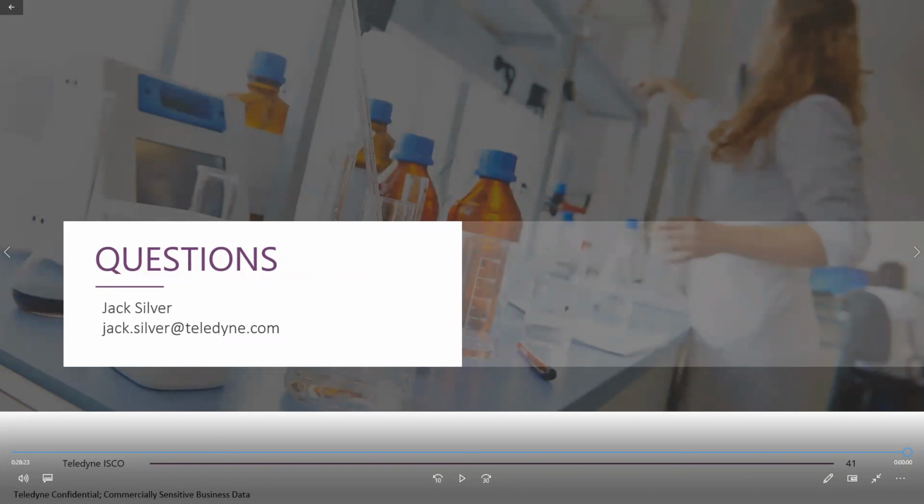Okay. Yep. How does an analytical scout calibrated to a focus gradient compare to the AccuPrep scout to focus? My experience is they work out about the same. In fact, we started off with doing the analytical scout calibrated to a focus gradient in the Journal of Combinatorial Chemistry paper that was cited earlier. And when we added the feature to the AccuPrep, we added in the gradient that is built in, the scouting gradient built into the AccuPrep to make it convenient for users.